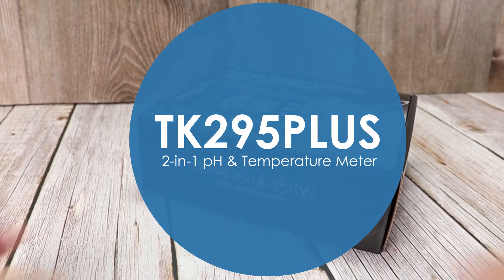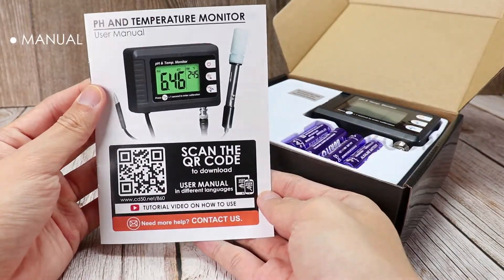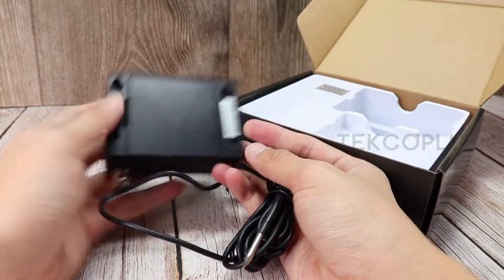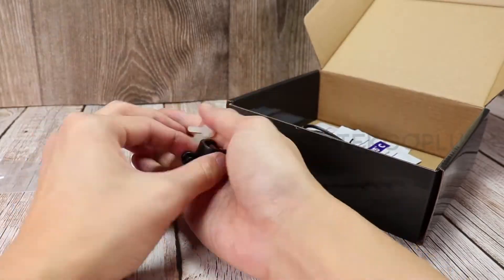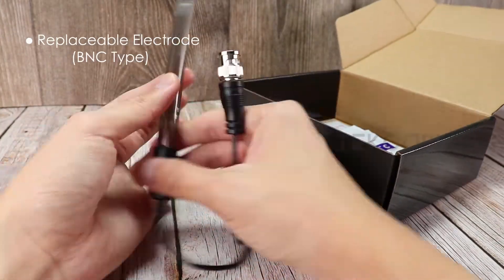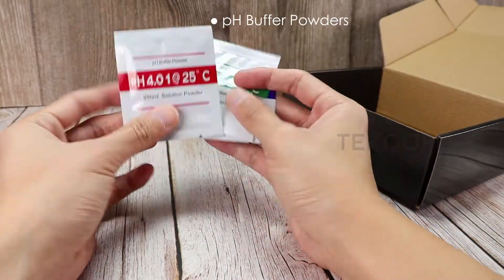TK295 Plus 2-in-1 pH and temperature meter set includes our packaging box, manual, pH and temperature monitor with built-in temperature probe, wall mount hanger and nylon screw, replaceable pH probe, and calibration buffer powder.